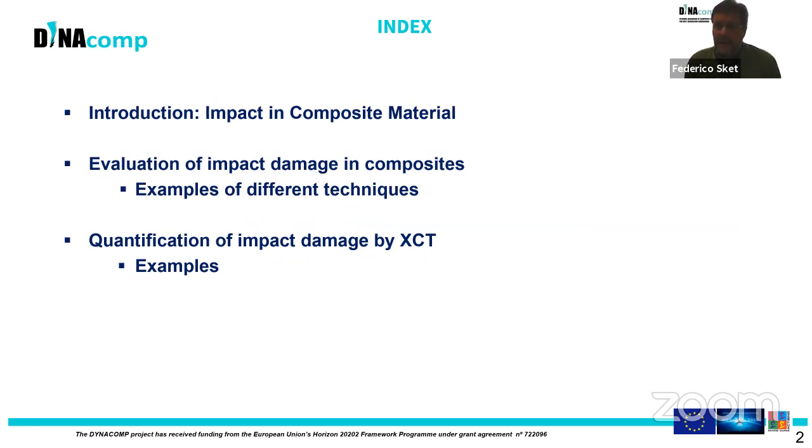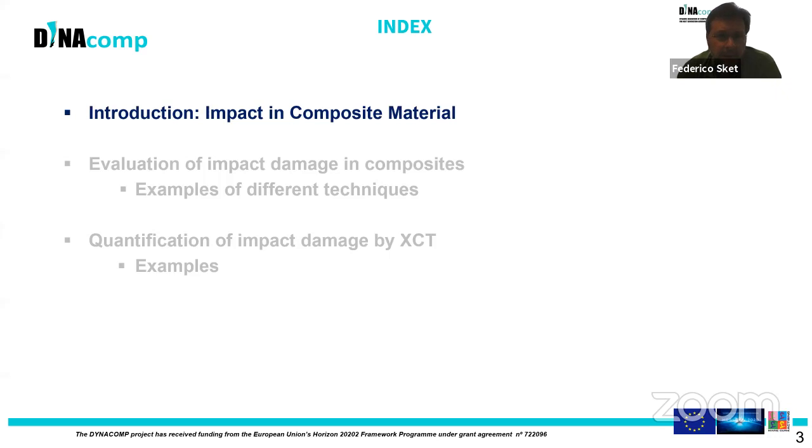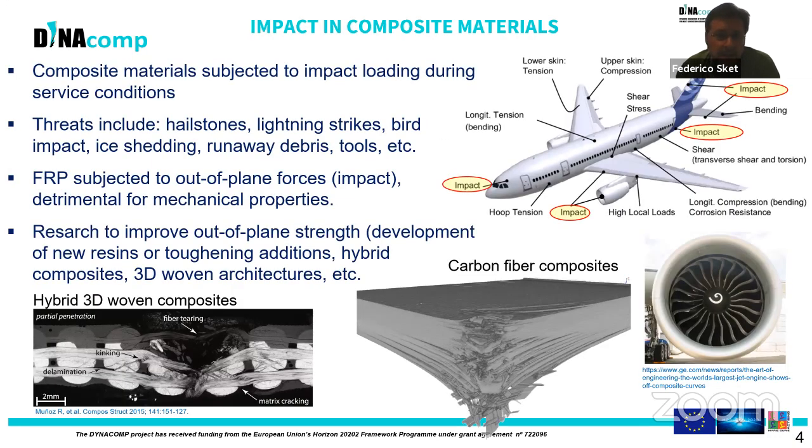This presentation is divided in 3 parts. I will start with a brief introduction about why impact in composite materials is important. Then I will cover a couple of techniques that are commonly used for evaluation of impact in composites. And following that, I will focus on quantification of impact damage by X-ray tomography and how this can be performed. So let's start with the introduction to impact in composite materials.